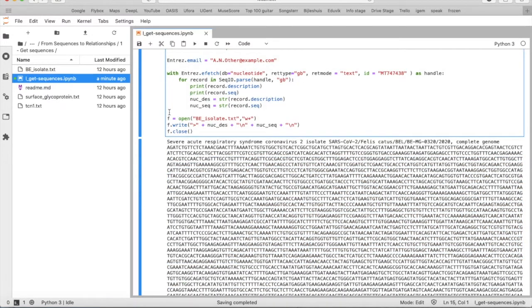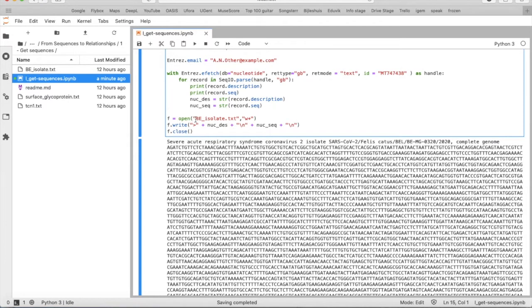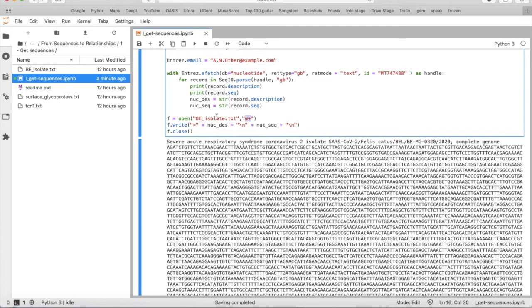So we want to save this FASTA file now. How do we do that? We say f is open BE isolate.txt, that's a new txt file that we make, and we provide here W plus that means that we will write a new file.